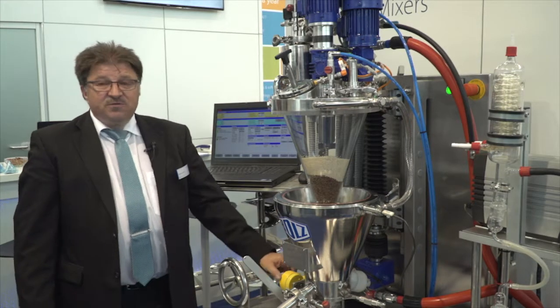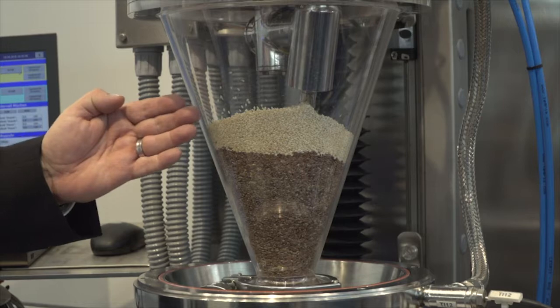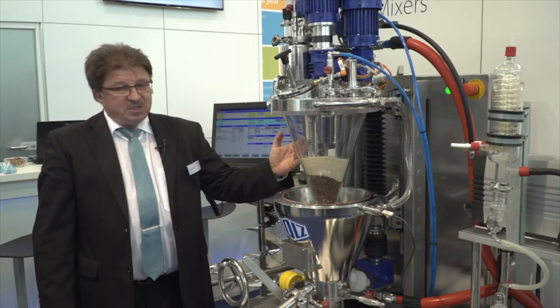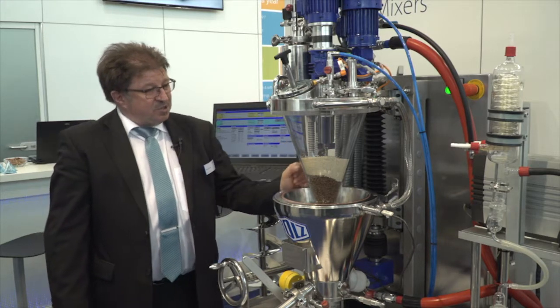This is mostly used for research and development with new products — a very gentle way of mixing. We also have the opportunity to install another agitator like a Helix central shaft dryer.